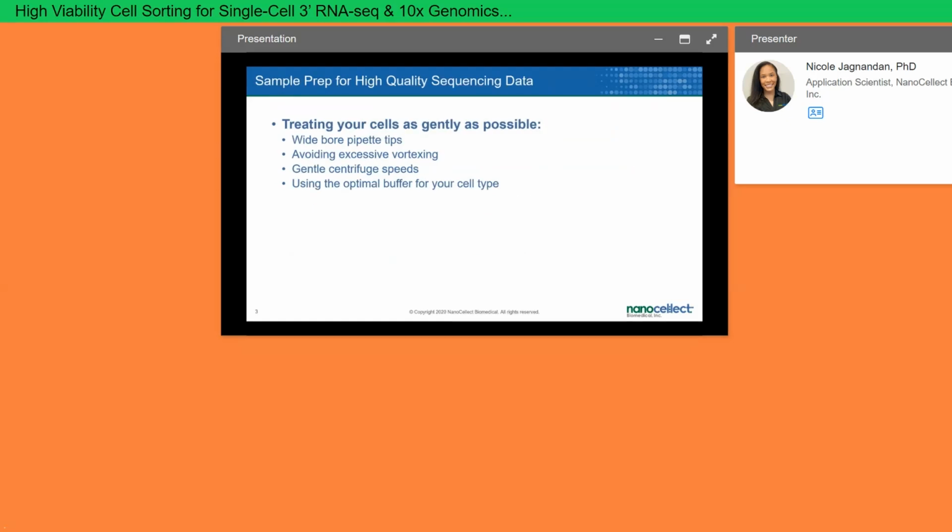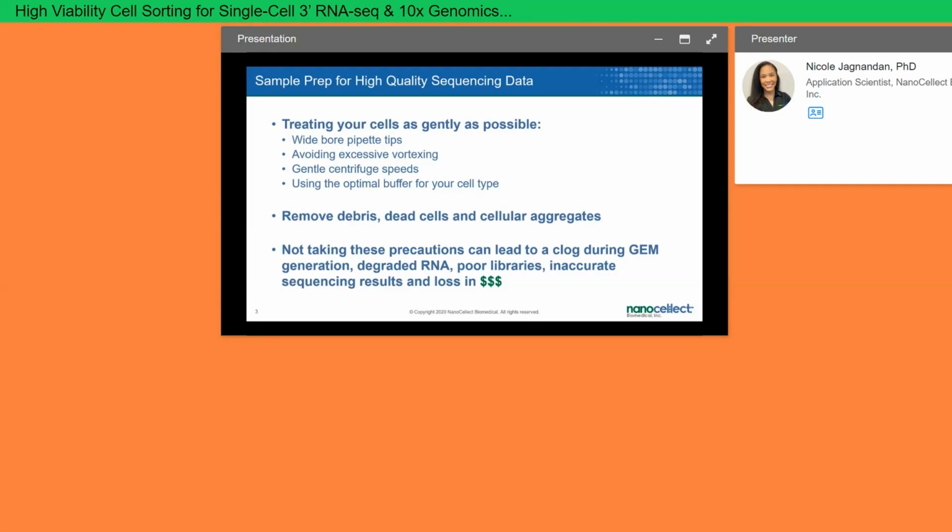When preparing your sample for single-cell sequencing, it is important that you treat your cells as gently as possible. Things such as using wide-bore pipette tips, avoiding excessive vortexing, using gentle centrifuge speeds, and using the optimal buffer for your cell type are all important techniques you should use. You should also remove any debris, dead cells, and cellular aggregates from your sample. Not taking these precautions can lead to a clog during your gem generation step, degraded RNA, poor library generation, inaccurate sequencing results, and a significant loss in money.